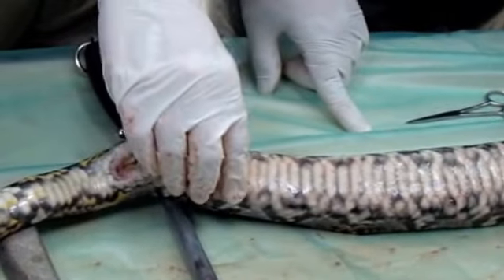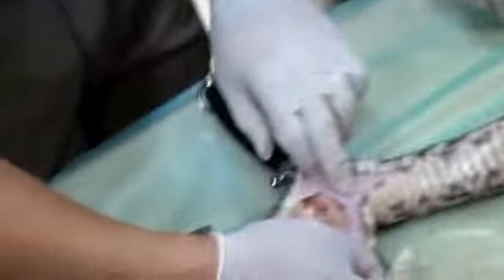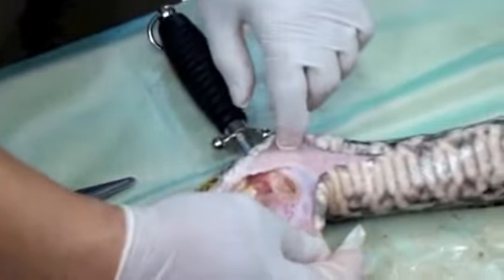Typically if they're going to do a dissection, they cut right down the middle. Okay, the other thing I want to point out, do not cut through the subcutaneous fat, because you'll get the organs, and they're going to get really stinky in here.